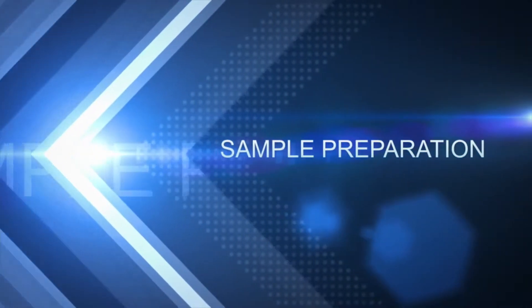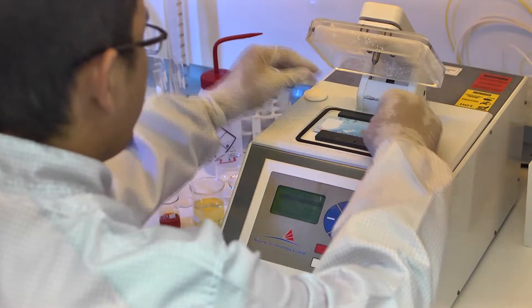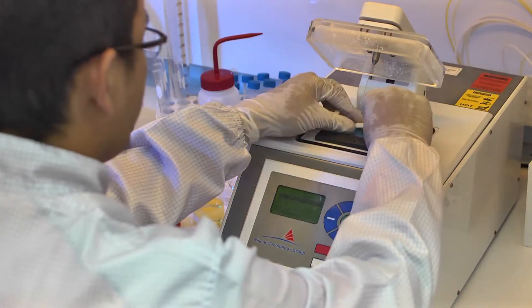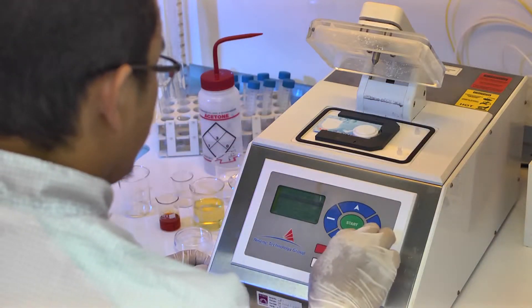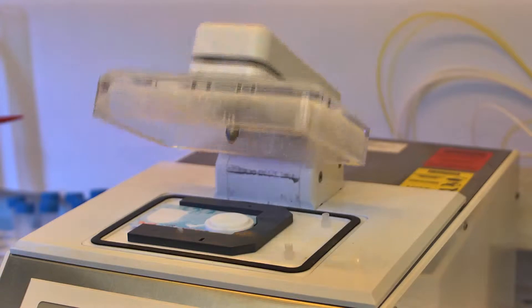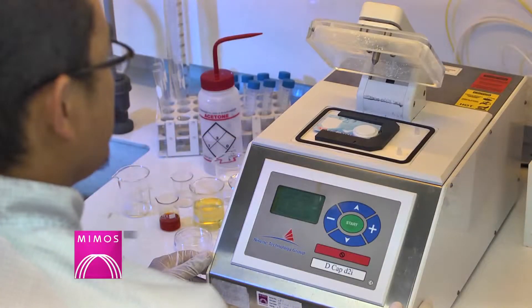Sample preparation is an important process to expose the internal conditions of the IC. The tools are capable to reveal the inner layers of the IC and also the hidden view of the defects. MIMOS FA Lab is equipped with various types of sample preparation tools.